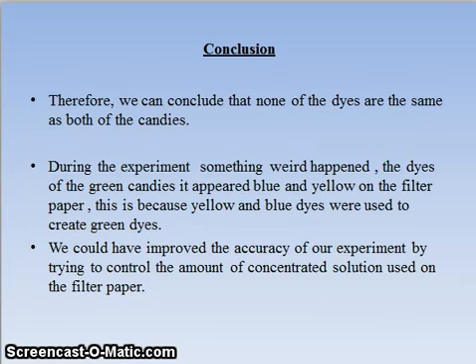We are in the conclusion that none of the dyes are the same for both candy brands. We also note that during the experiment, the dye of the green candies appeared blue and yellow on the filter paper. This is because yellow and blue dyes were used to create green dyes.